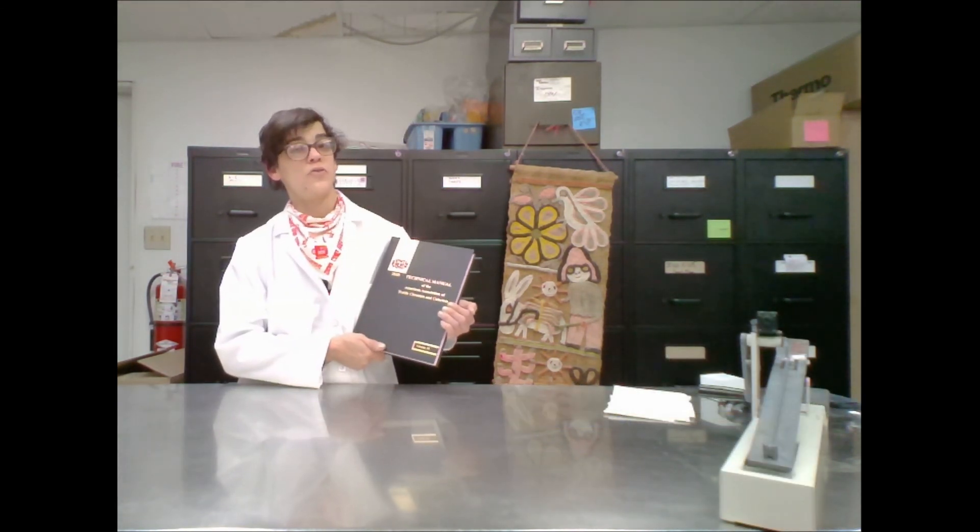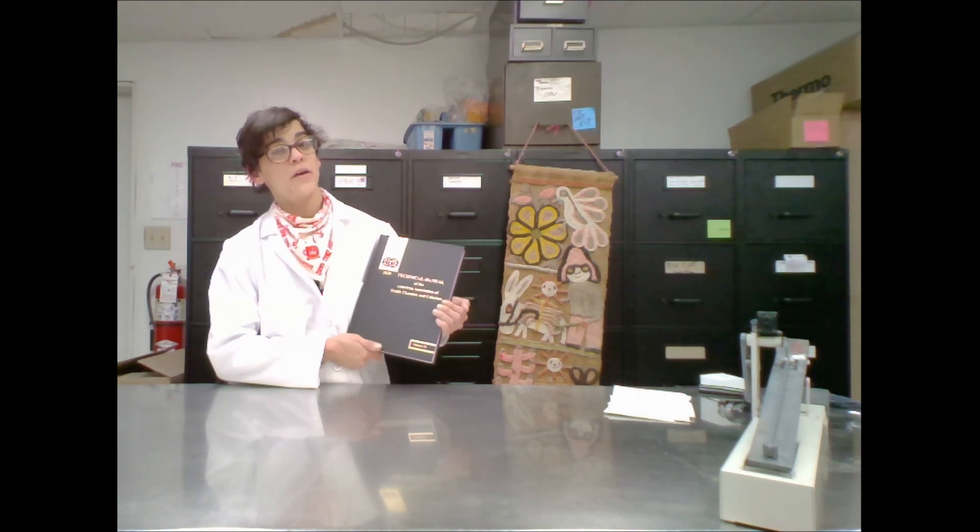We have a long history with the AATCC and we are suppliers of all the test materials you need to conduct colorfastness testing today. Thank you.